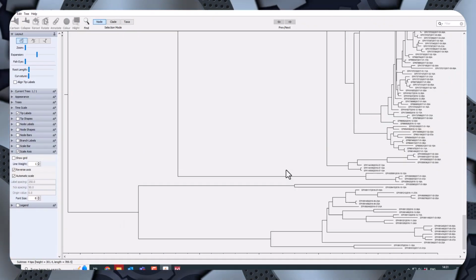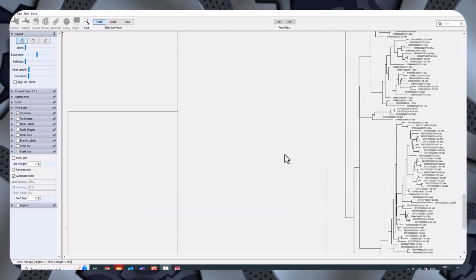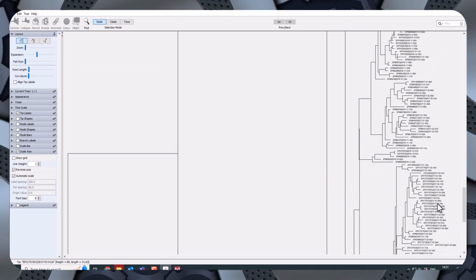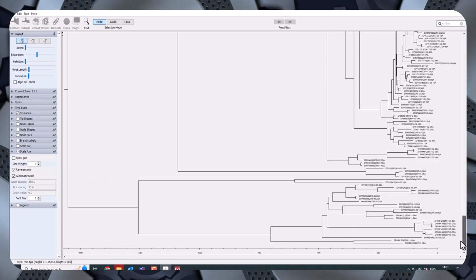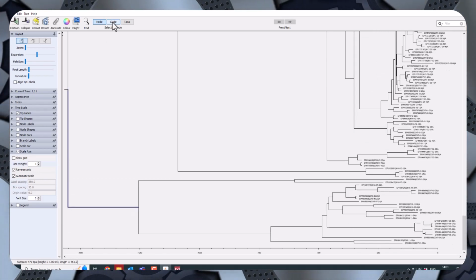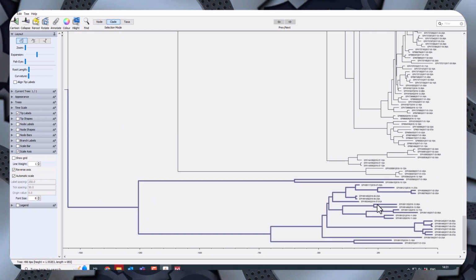I don't have all the rest of it. So when you've got very big and complicated trees, what you want to do is pick out bits that have different pieces of information and cut them and paste them into new files, and then do the analysis of those files.